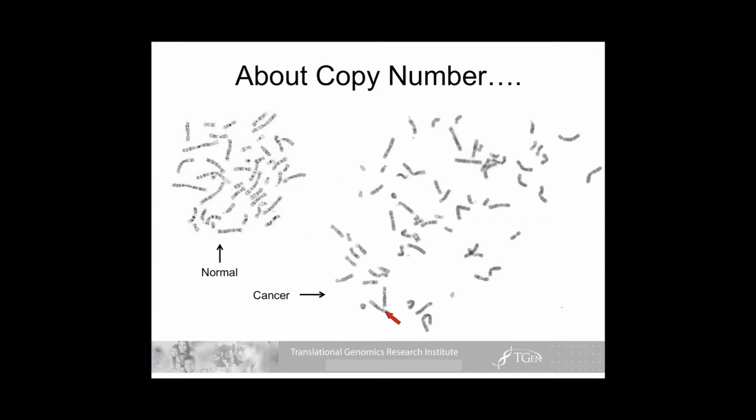This part here of this chromosome is chromosome 6. This is a relatively normal chromosome 6. The normal chromosome 6 over there, where is it? Oh, come on. There is a normal chromosome 6 over here somewhere. It's just not jumping out at me.